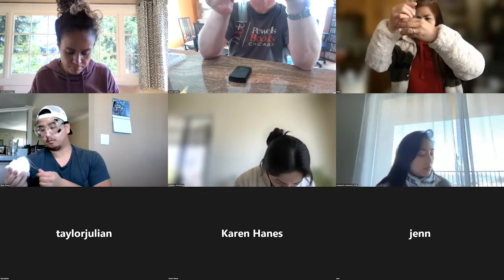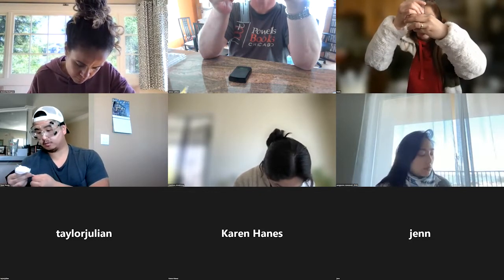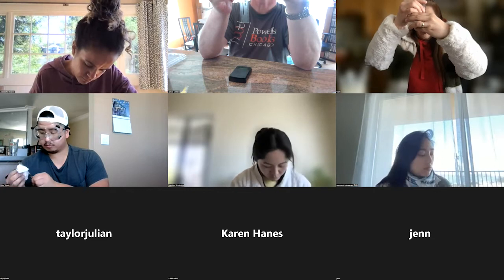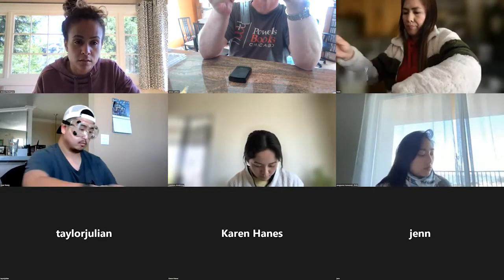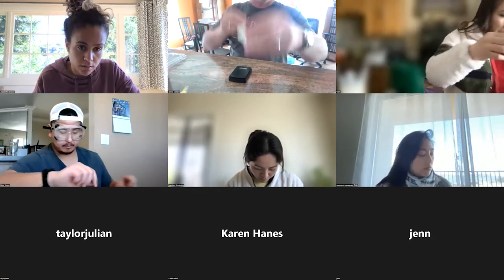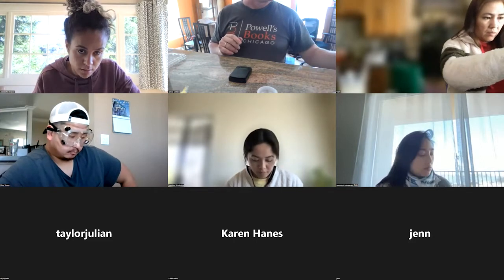Here we go. Looks to be 20 millimeters, shockingly enough. There you go. That makes it easy. So 20 millimeters is the distance.